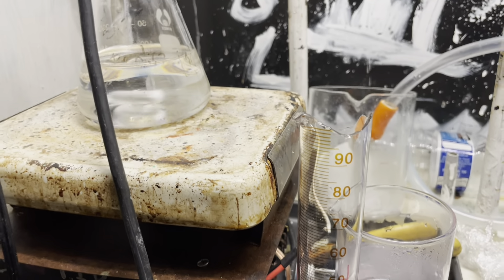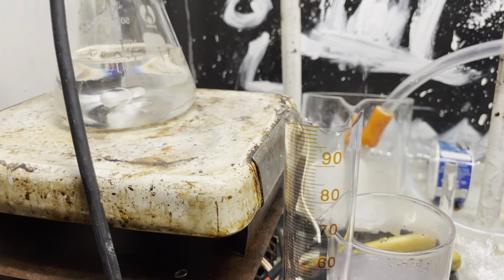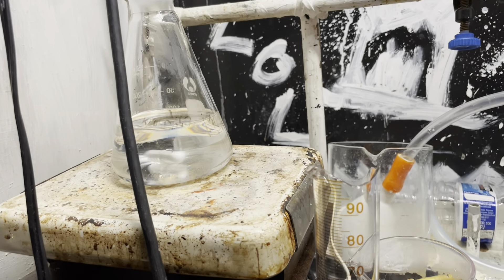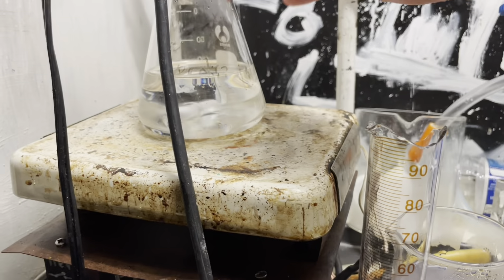Welcome back, fellow drivers, and today we'll be synthesizing paratoluene sulfonic acid, otherwise known as paratosylic acid. This is a useful acid catalyst in the organic lab, and we'll be using it in a future video.